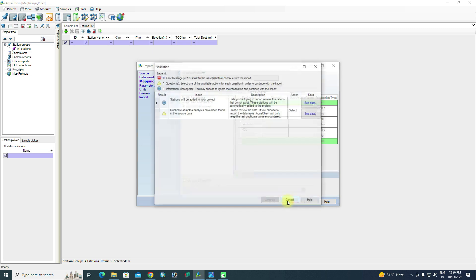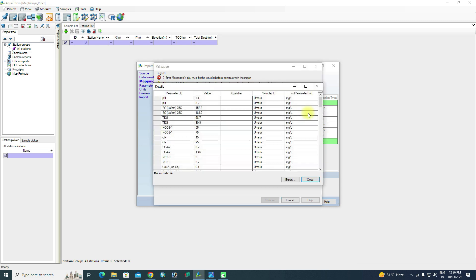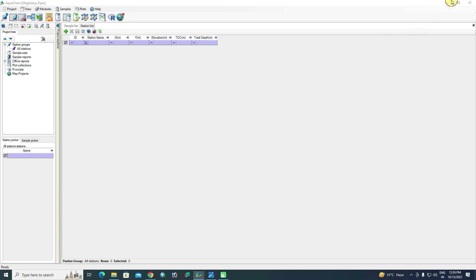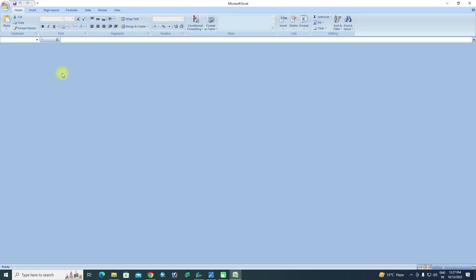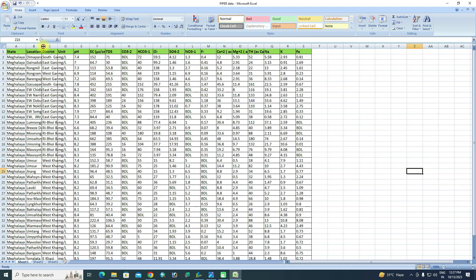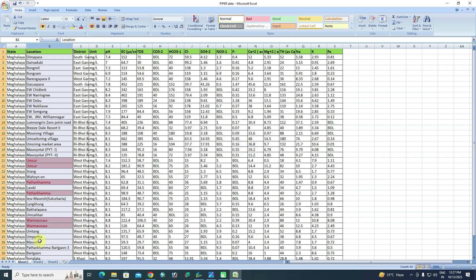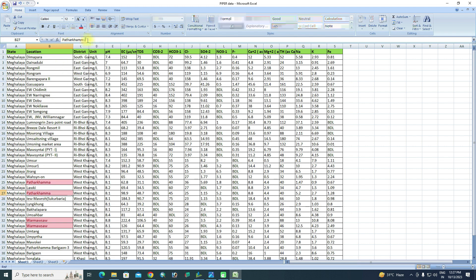An error appears: 'Duplicate sample analysis have been found.' You can see in the location column that some duplicate names exist. Cancel the import. Go back to the Excel sheet, select the location column, and use Conditional Formatting — Highlight Cell Rules — Duplicate Values to identify them. Change the duplicate names (e.g., add numbers like 1, 2, 3) to make each name unique. Do this for all duplicates.